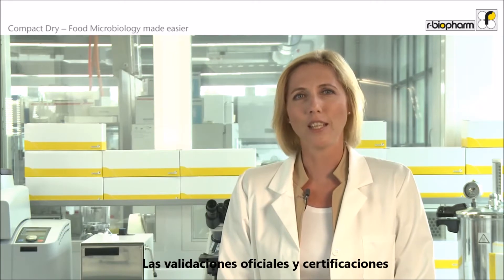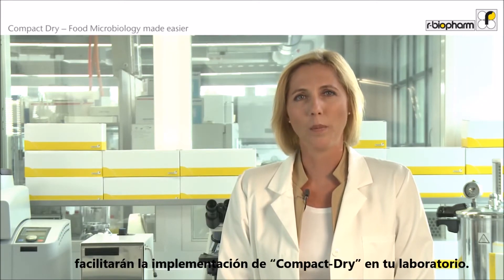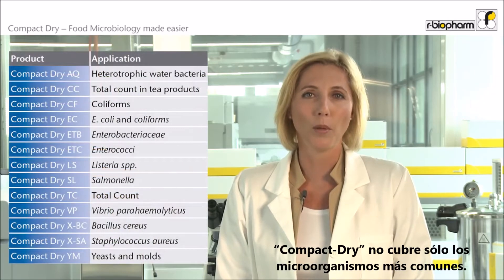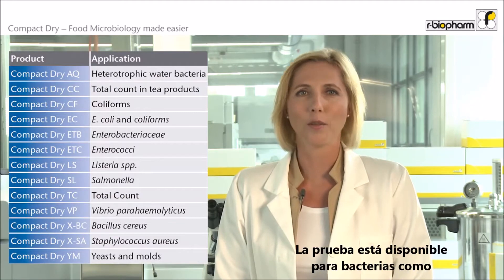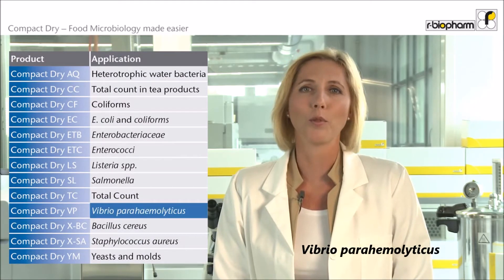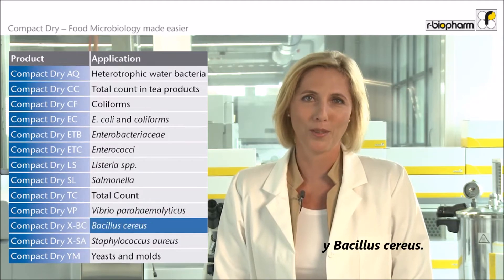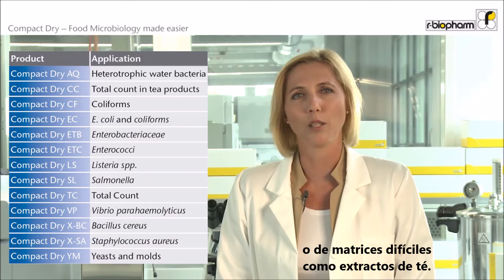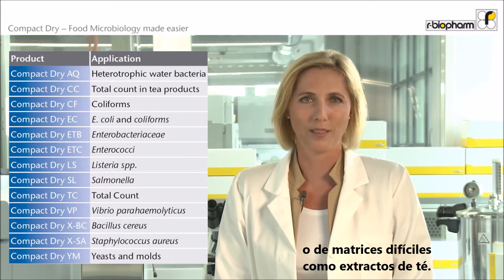The official validations and certifications will make implementation of Compact Dry in your laboratory easier. Compact Dry does not only cover the most common microorganisms — the tests are also available for bacteria like Listeria, Vibrio parahaemolyticus and Bacillus cereus. You can also use Compact Dry for water testing or testing difficult products like tea extracts.